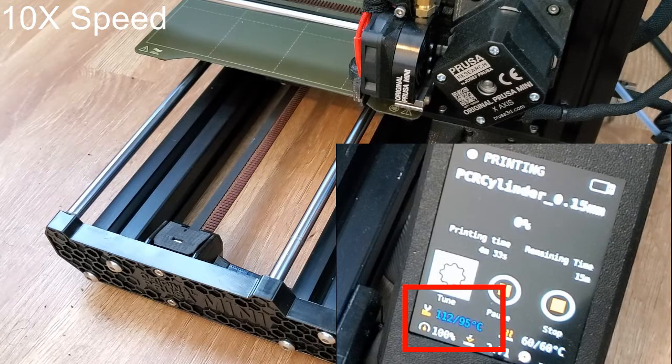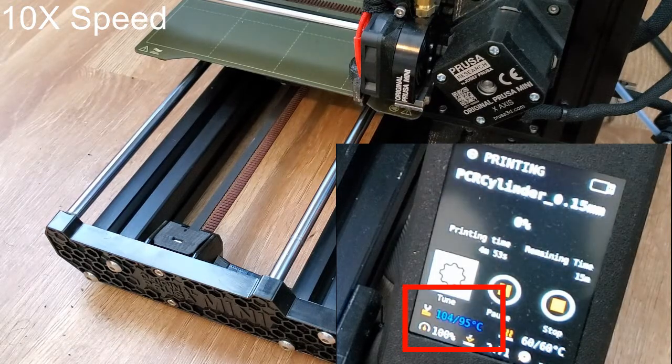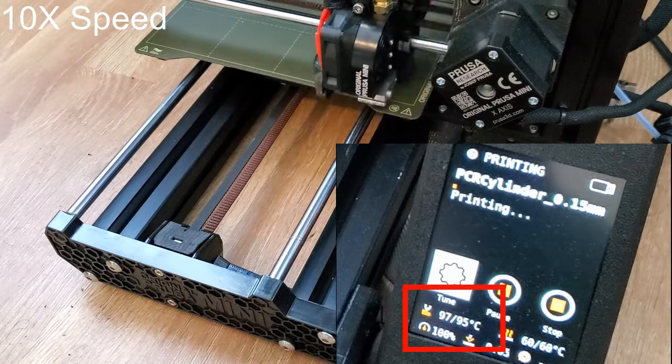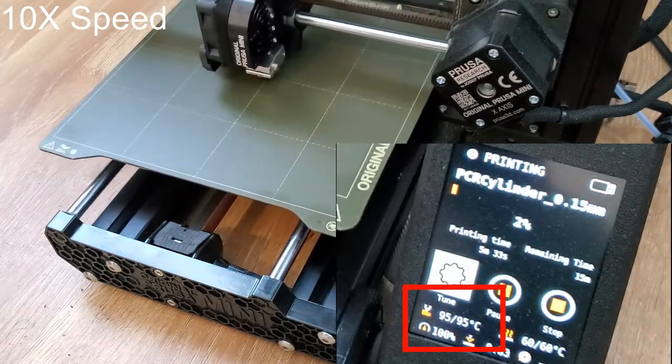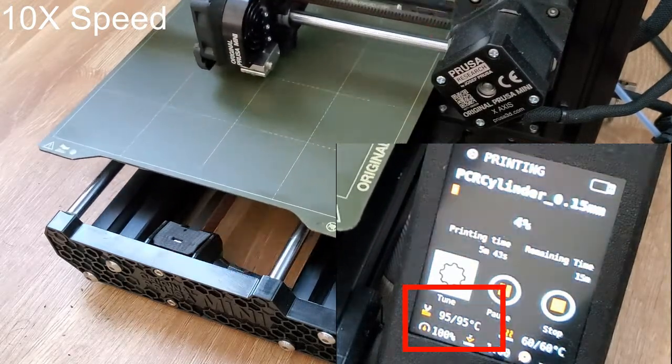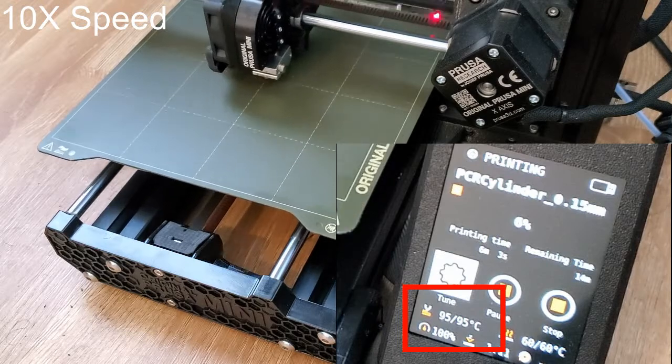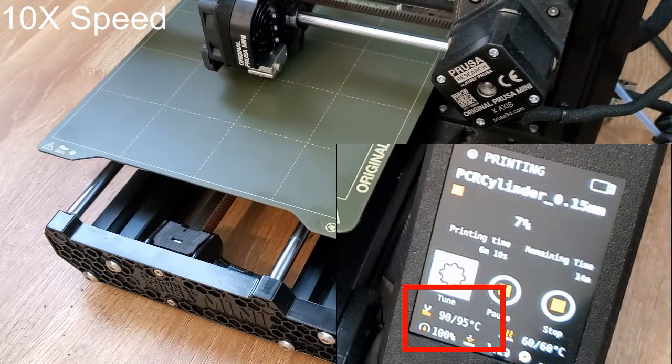When I saw this, I thought that sounded a lot like a thermocycler or PCR machine, where a temperature is controlled at specific increments to replicate DNA. So I decided to try hacking my Prusa Mini Plus to function as a PCR machine.